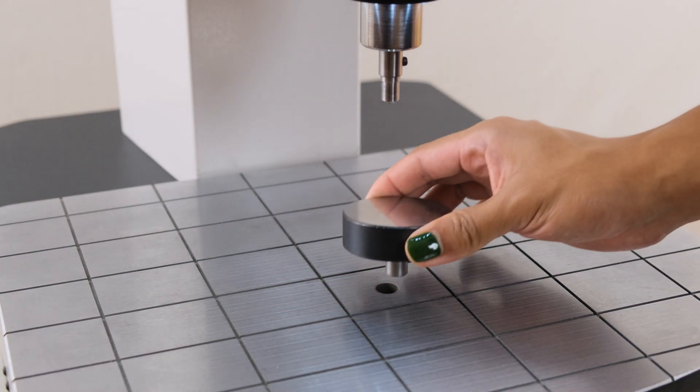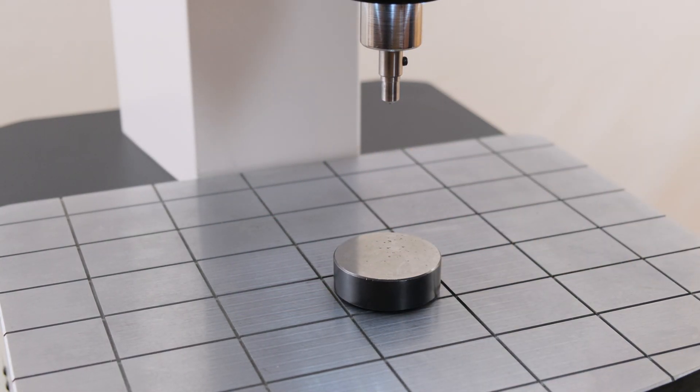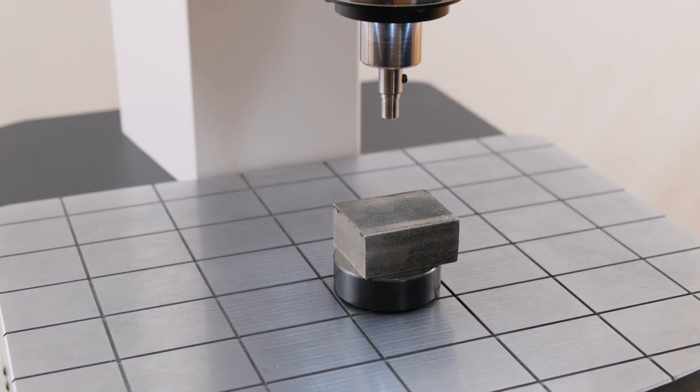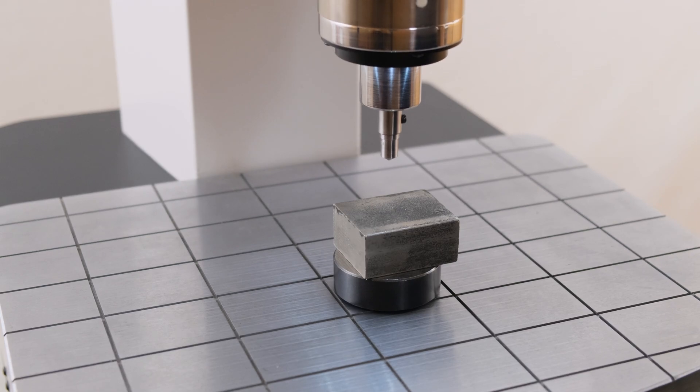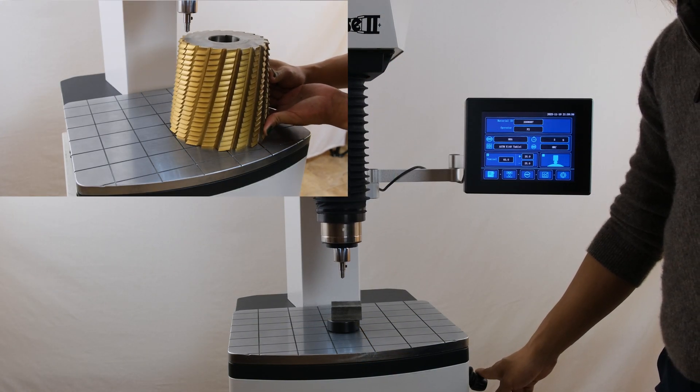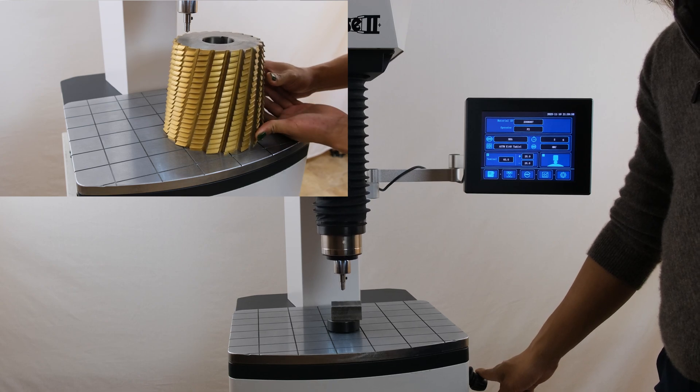To start testing, begin by affixing your test block on the anvil, making sure to use the joystick to move the indenter head to allow for clearance between the indenter and the sample. Note that if a part is particularly large, it may be mounted directly onto the work area.